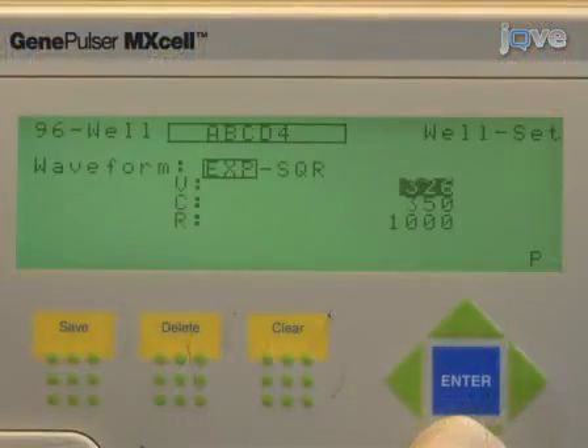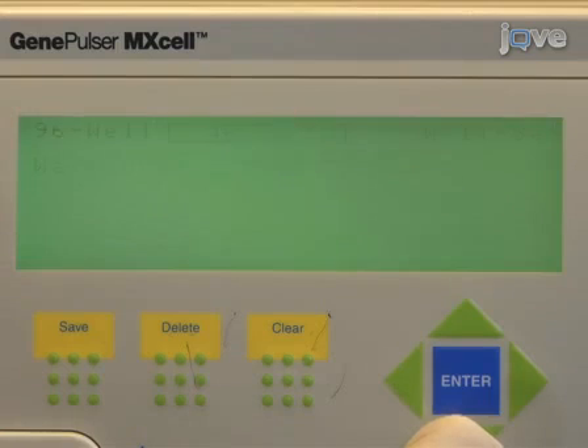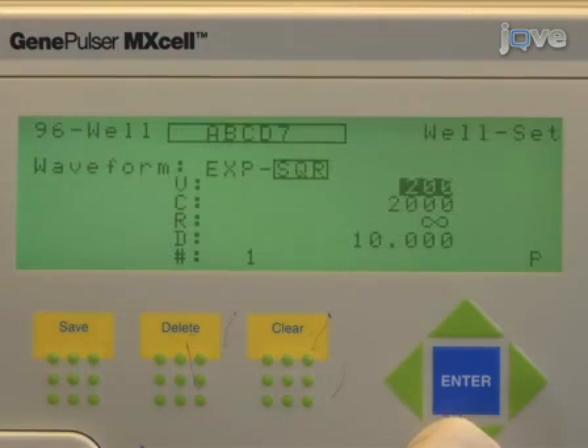Your experiment probably won't involve different ages of cells, but you can follow the same procedure with your own experimental design. If you want to compare gene expression in control and treated cells, you can first find the best conditions and then do your experiment using the conditions you've identified. Or, you can do your optimization and experiment together, like I will demonstrate today.